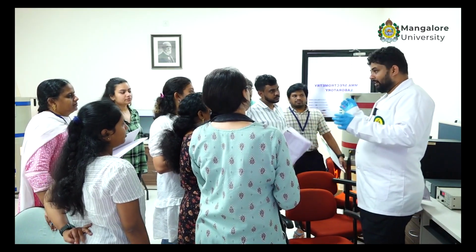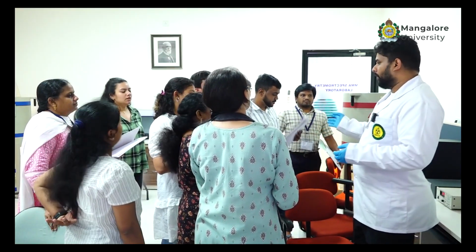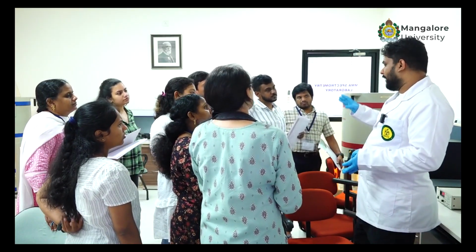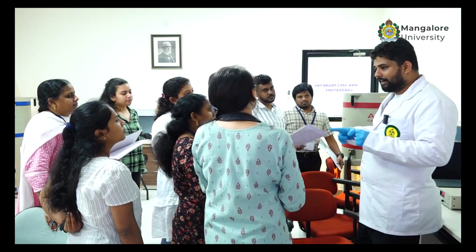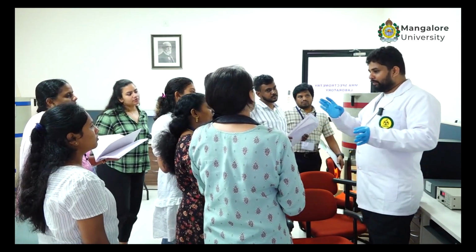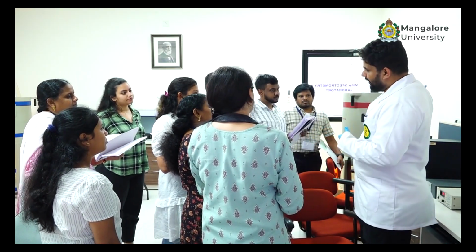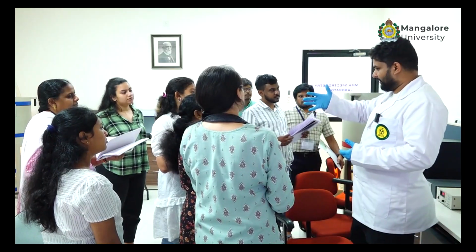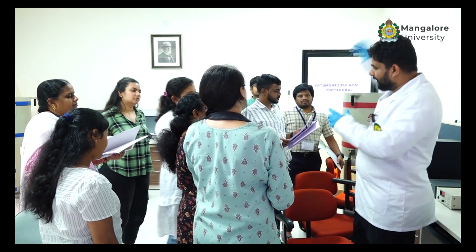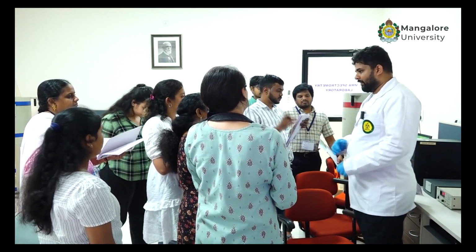It is widely different. That is why all these things we have said, geometry is always important. Also, in yesterday's class, 3 different batches did efficiency in 3 different detectors, correct? And detector efficiency between the 3 detectors is quite different, correct? So you might have observed that also. But if another batch has also done it in these 3 detectors, then the person who has done it in the same detector should get similar values. So that also you can check.